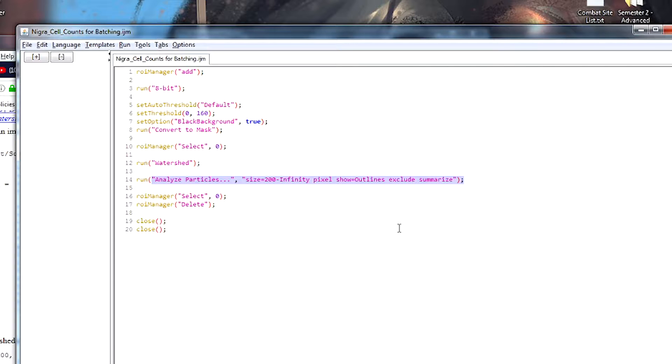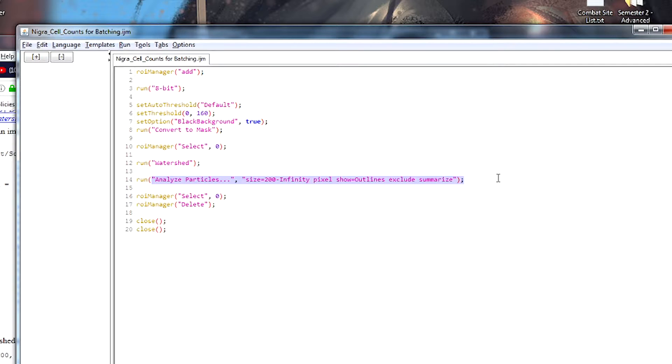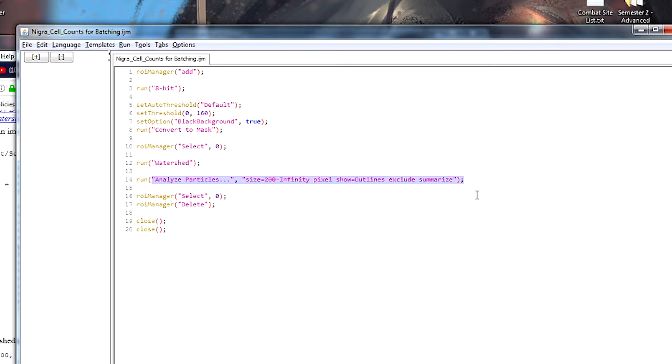Some cells are bigger, some cells are smaller. Some cells we're going to have taken the section through parts of the cell and so it's not a full cross-section. Somewhere we have to draw a line and say, everything bigger than this size, we're going to call a cell. Everything smaller than this size, we're going to say that that's too small to call a cell. And we just have to choose a number. And so in this case, we've tried a few different ones and we've chosen 200 because that seems to give a reasonable estimate.